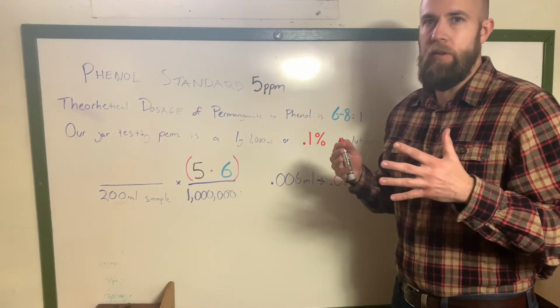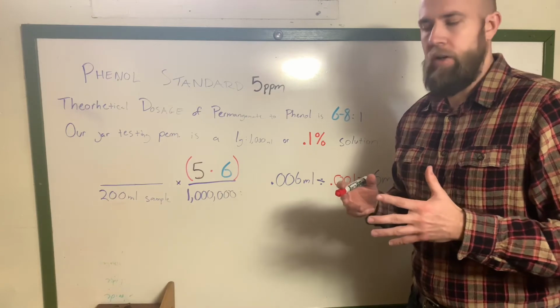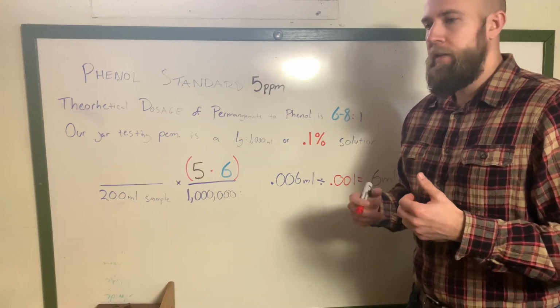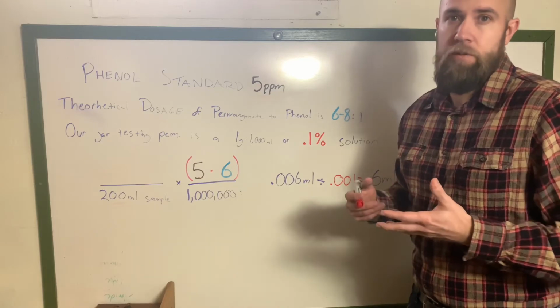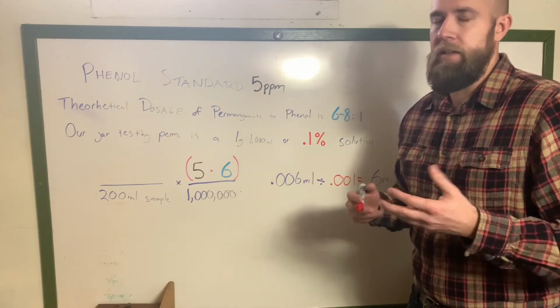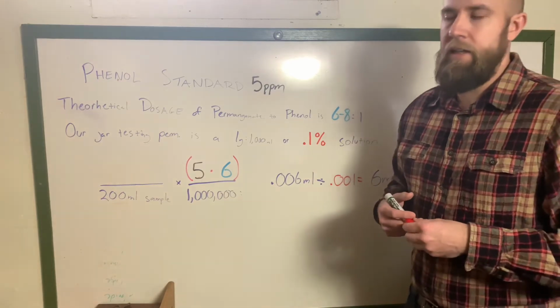Today I wanted to go over phenol destruction. So every so often in wastewater treatment, we come across a customer or prospect that has phenols in their effluent. This is a major problem. Cities don't want to have it. Your customer, most of the time that'll have phenols, is a central wastewater treater. It could also be somebody working in antiseptics, disinfectants, wood stains, etc.